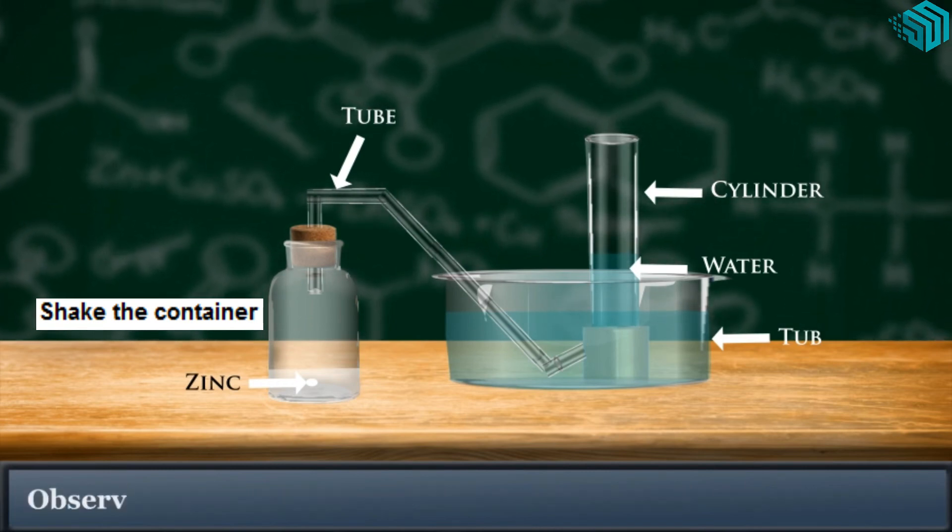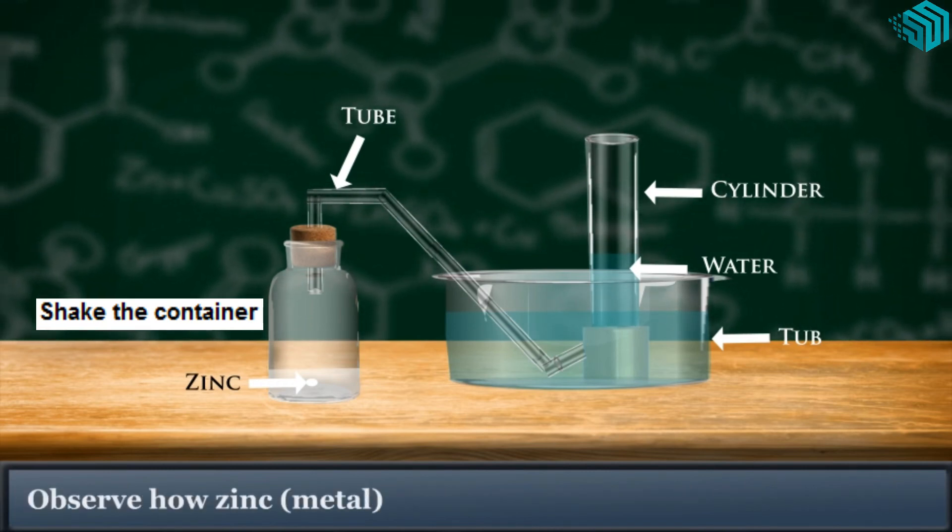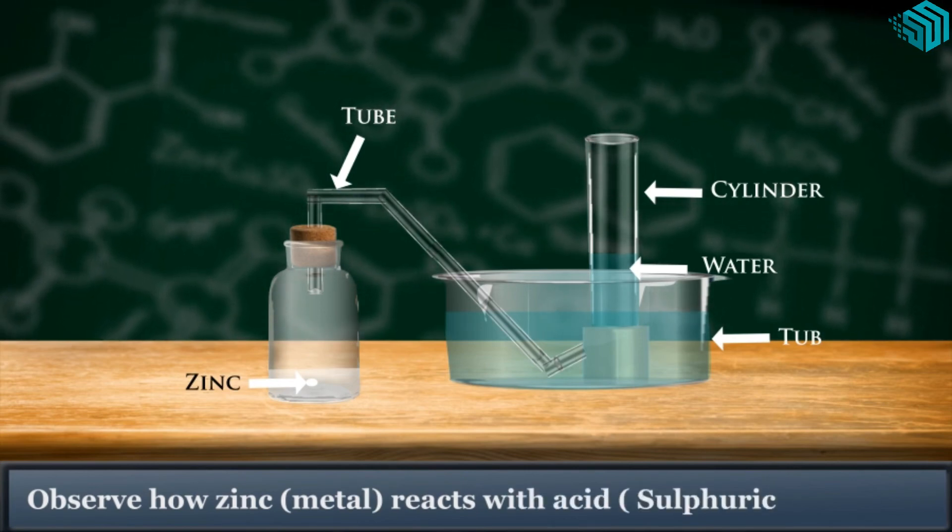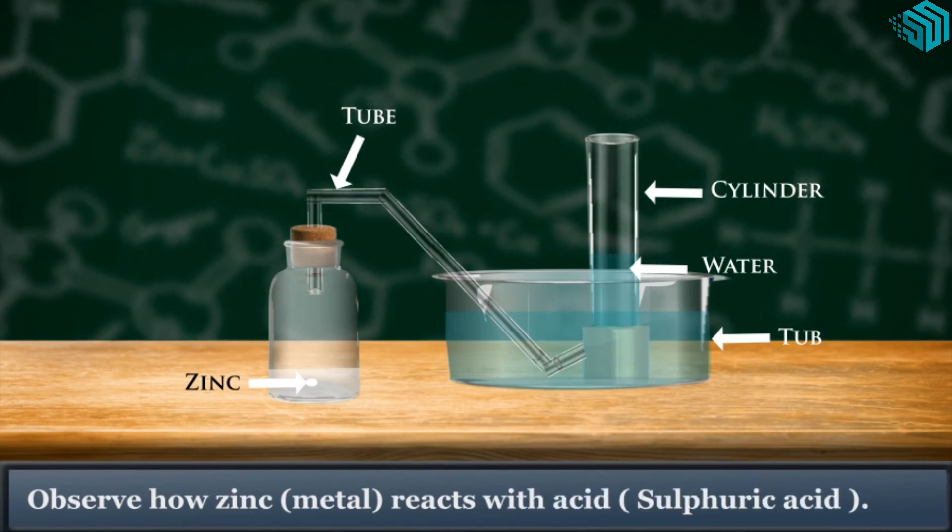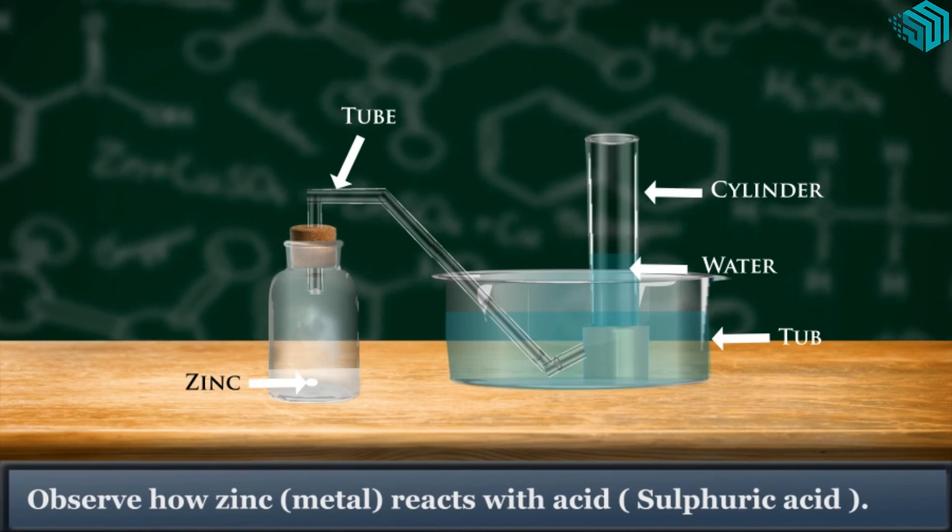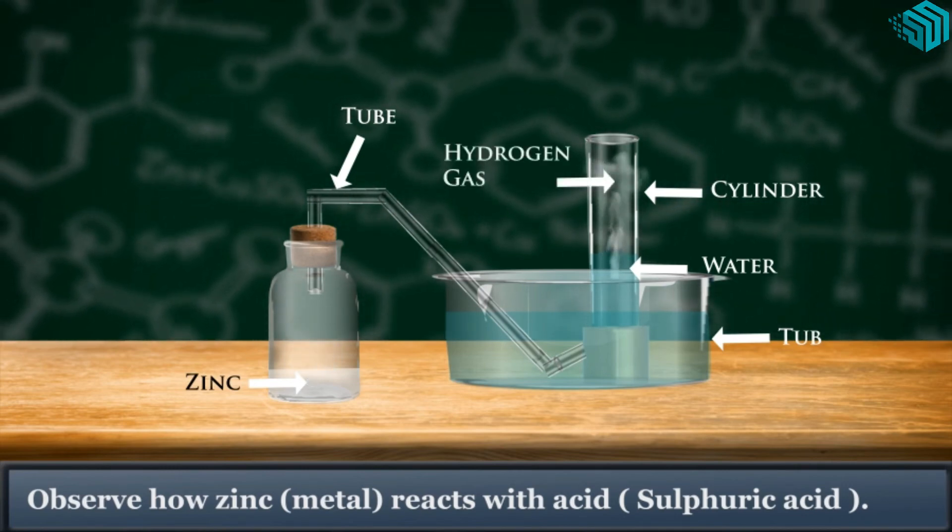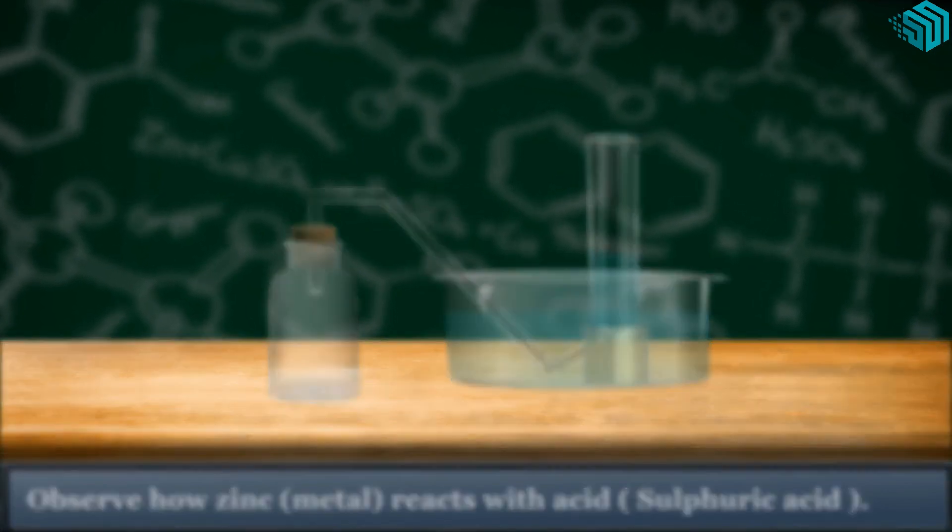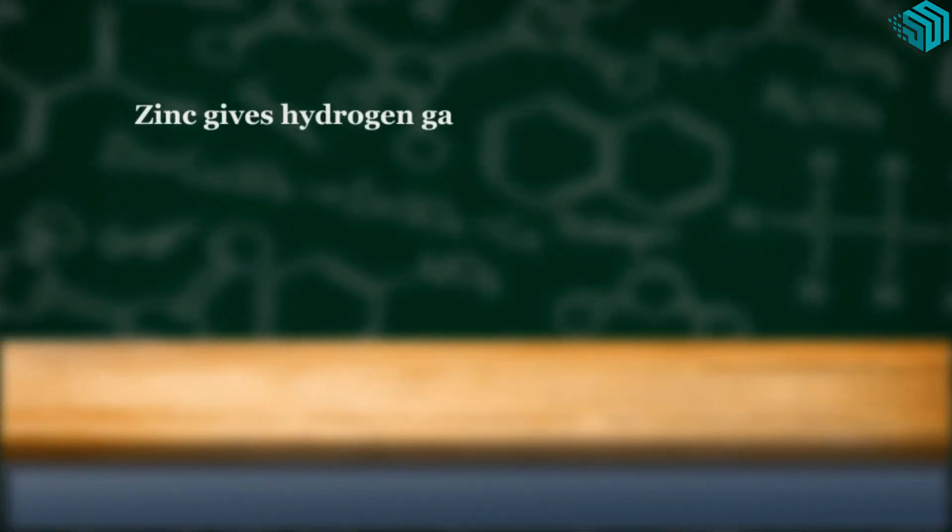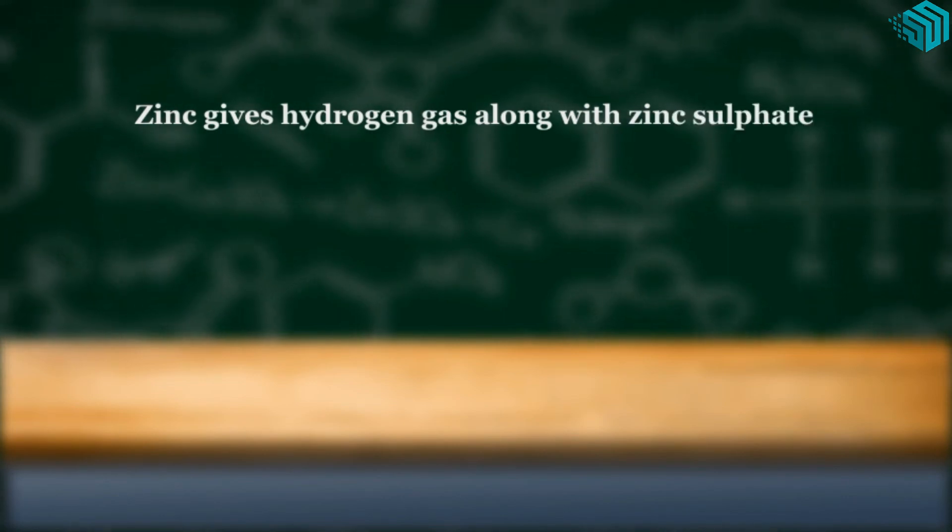Observe how zinc, which is metal, reacts with acid, which is sulfuric acid. Zinc gives hydrogen gas along with zinc sulfate when it reacts with sulfuric acid.